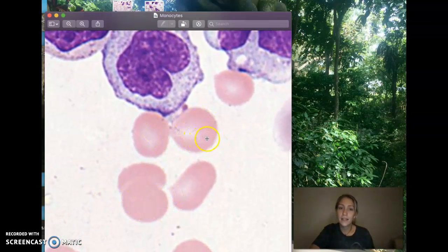These are the red blood cells here, and instead of having that biconcave shape where they can fold and go through capillaries to transport through the blood, they get a sickle shape. That causes blockages in blood vessels and prevents blood flow to certain organs and tissues that need it. So not as much oxygen is transported to those tissues and organs.